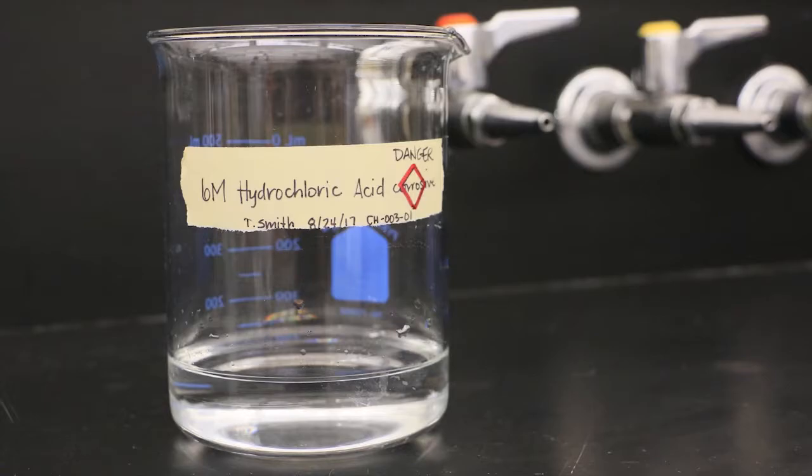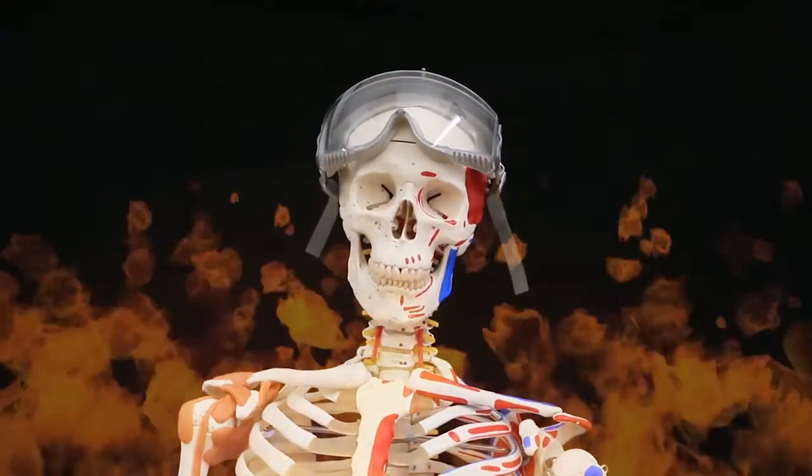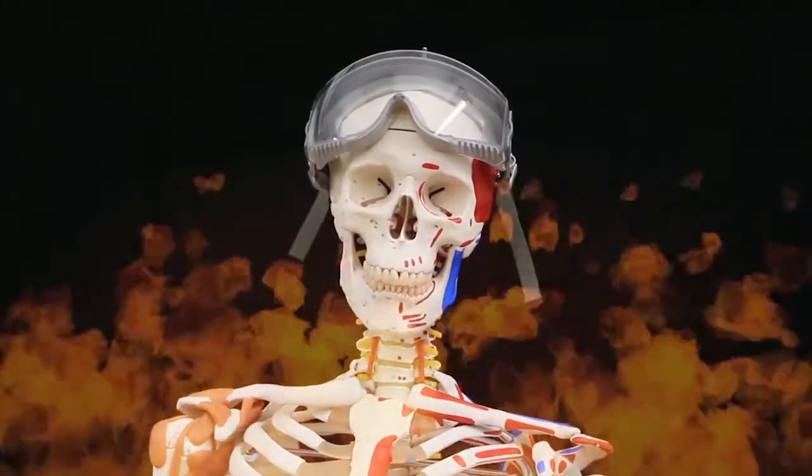Successful disposal starts with knowing the composition of the waste. This is easily done by always remembering to label your chemical and waste containers, like such. Knowing the composition will allow you and your professor to know the compatibility and/or reactivity between specific chemicals. Mixing chemicals that are not compatible is the common cause of lab fires, something we all want to avoid.